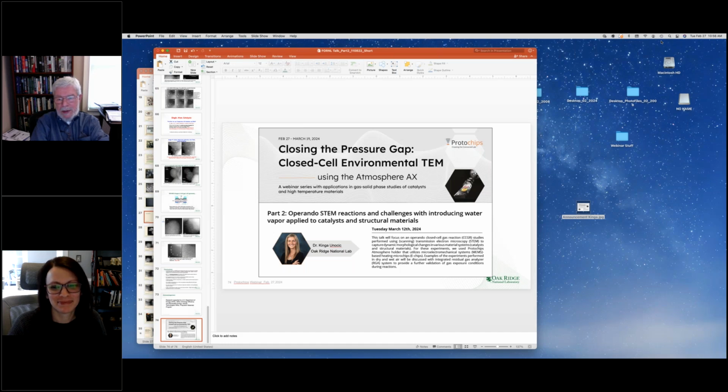And we did that early work in 2019, just before COVID was going to start. And we were expecting to get a xenon plasma FIB at Oak Ridge, we thought within the next year or so. COVID hit and everything kind of came to a screeching halt.